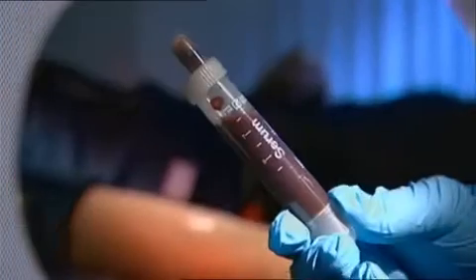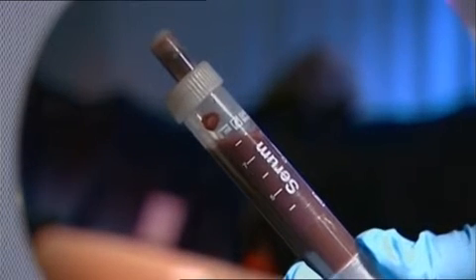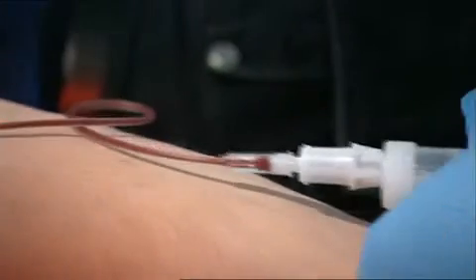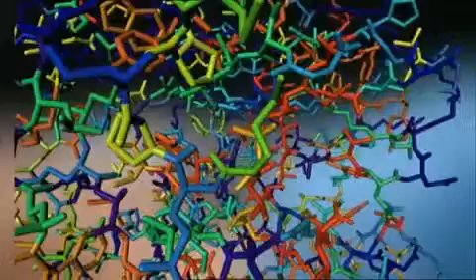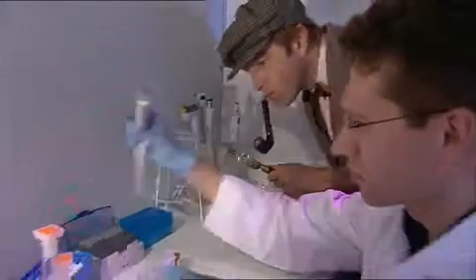Blood, a very interesting object for investigations, not only to criminalists. Also, medical scientists are highly interested, in particular, in certain particles of the blood. The proteins. These are the actual suspects, since they play an important role in the process of developing diseases, for example, cancer. The hunt for clues starts.